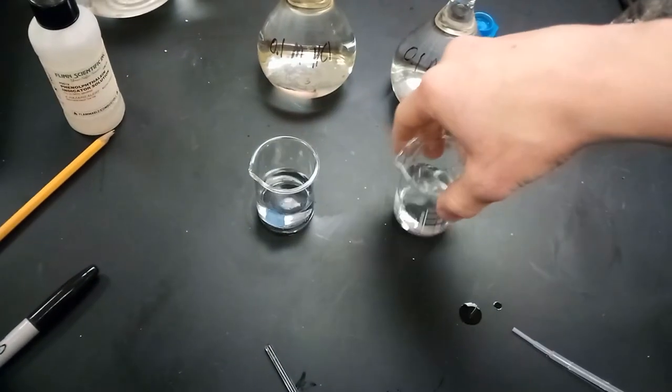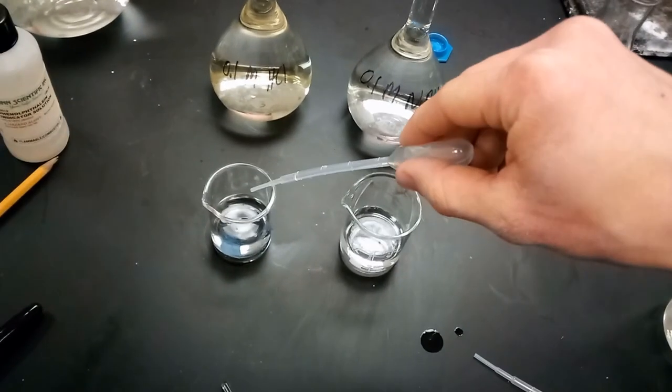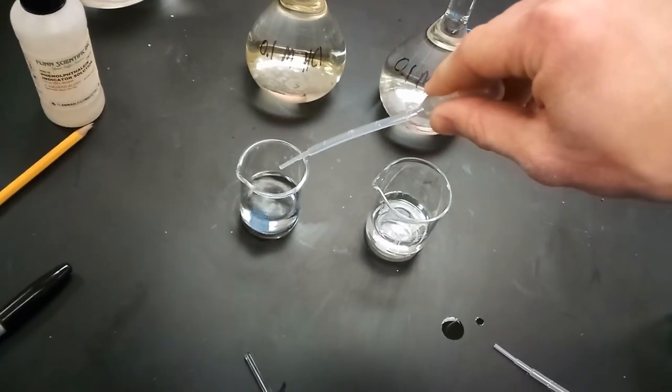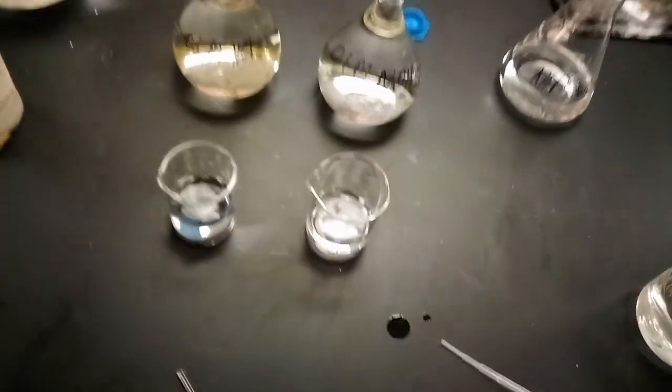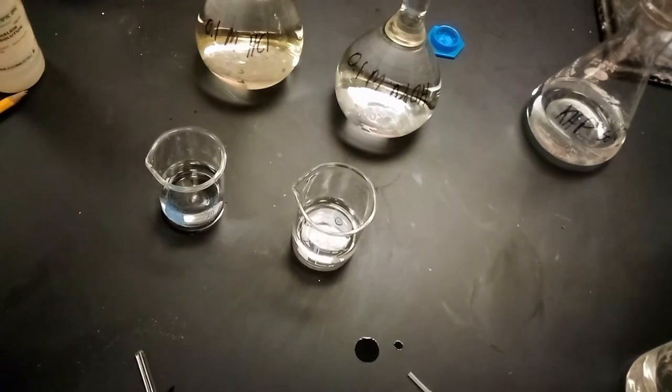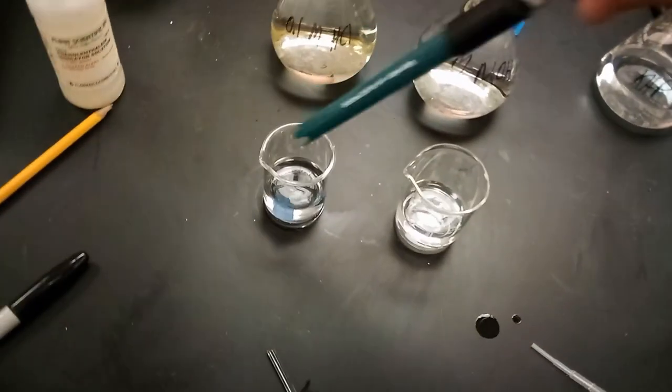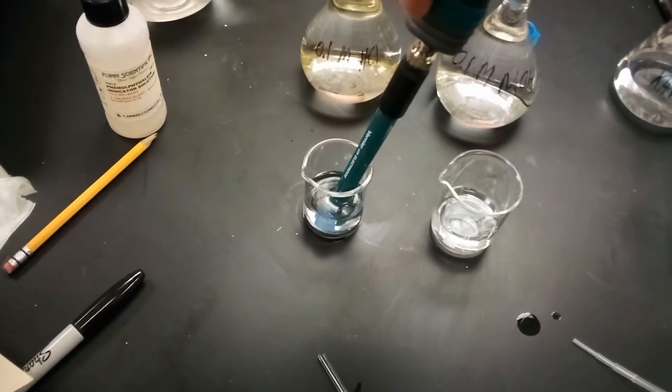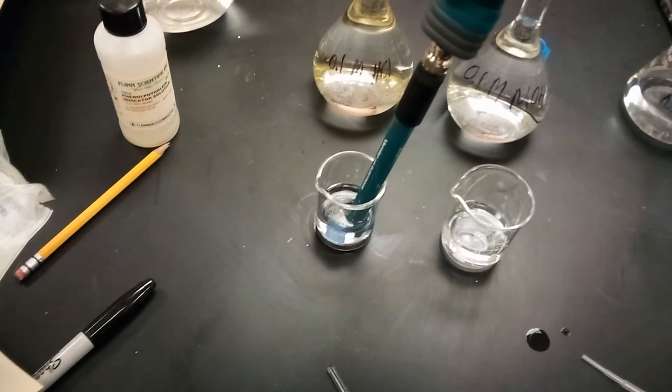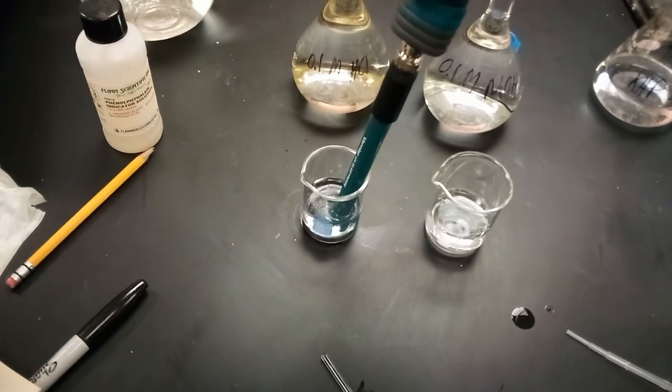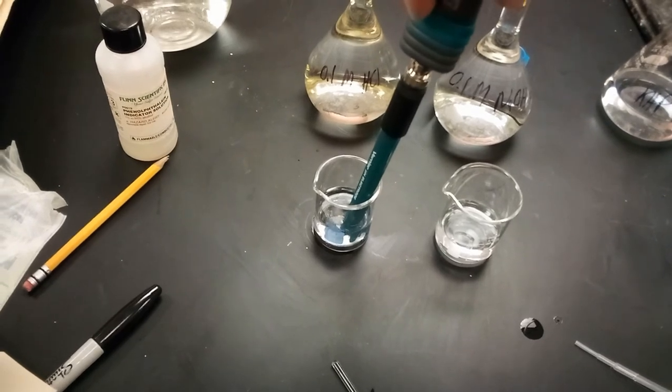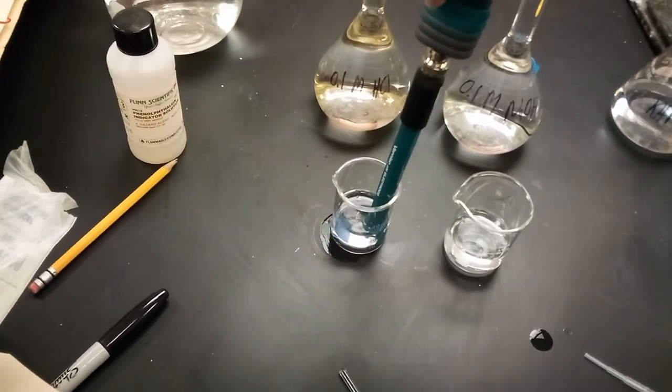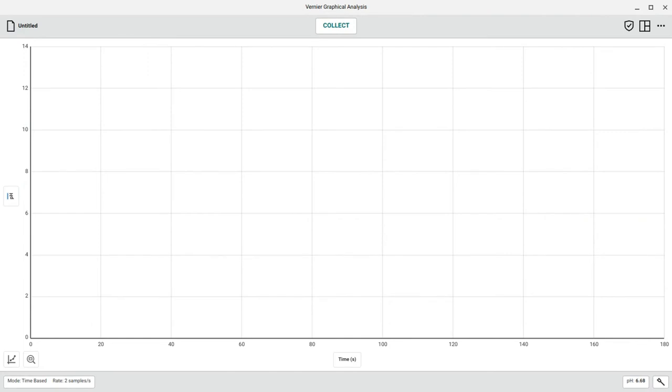So I've switched the beakers out for beakers of distilled water. Again, we'll be adding five drops of 0.1 molar HCl. And then using the pH electrode like so, we'll put it in there and see what has changed, if the pH level has changed more drastically in this instance now that we're not using the buffer. Hopefully you can notice a much more significant change in pH from the pH of the water to the pH after addition of the hydrochloric acid.